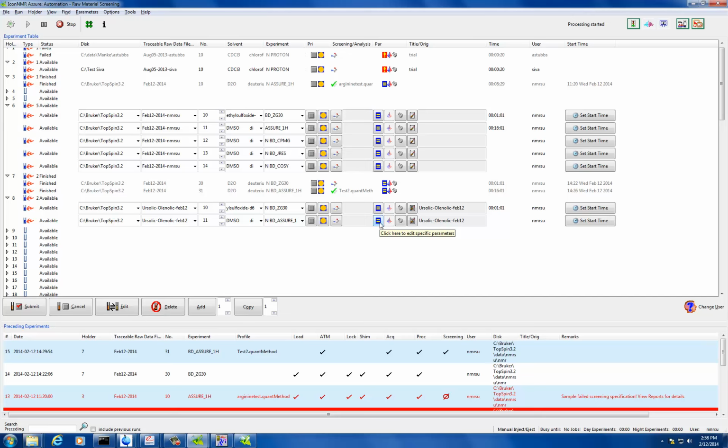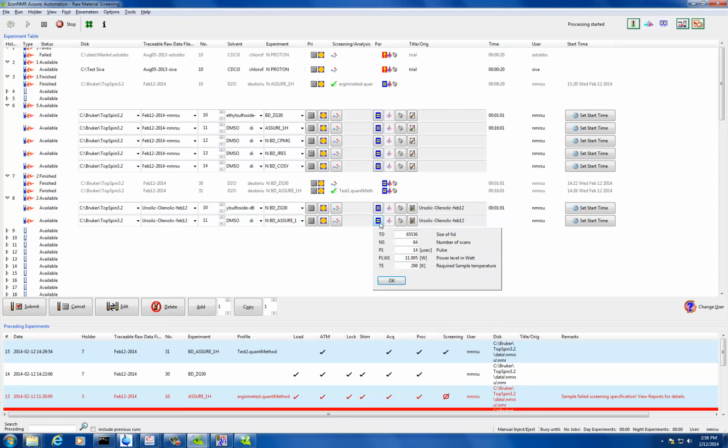So click on that. Let's put that for now. 8 minutes, 32. So make it 8 minutes. Which one is that? This one? 64 to 32. Yeah, we'll change it to 32, the number of scans. Okay, awesome. And then highlight both of them and then submit it.